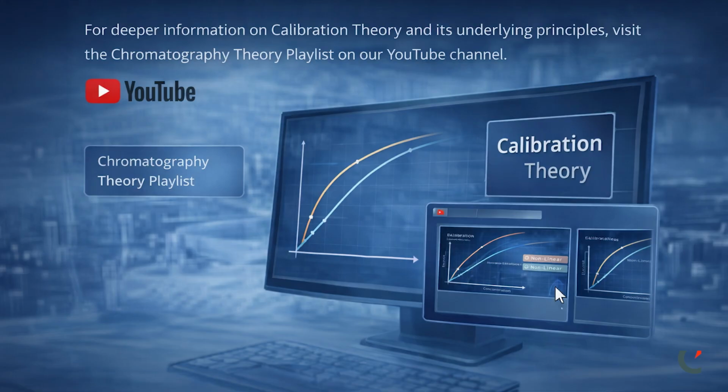If you would like a deeper understanding of the theory behind calibration, including response factors and calibration curves, you can refer to the Chromatography Theory playlist on our YouTube channel. In particular, the chapters titled Calibration Theory provide a more detailed explanation of the underlying principles.